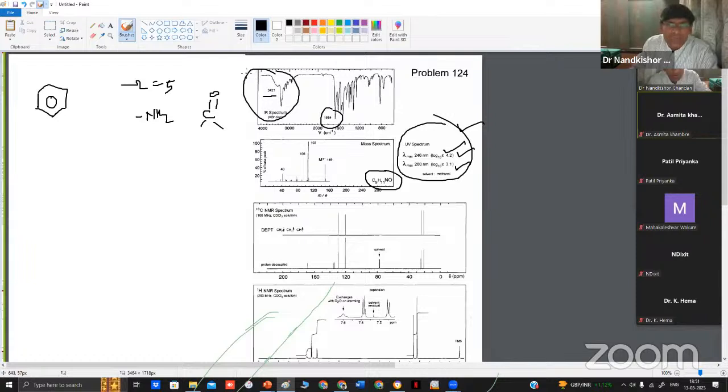So there are higher stretching frequencies. That is the nitrogen stretch at 3400 and then the carbonyl stretch. That is enough for this. For further values you can comment on the alkyl stretch, which is below 3000; that you can easily write down. Now, next you can come directly to the proton magnetic resonance.